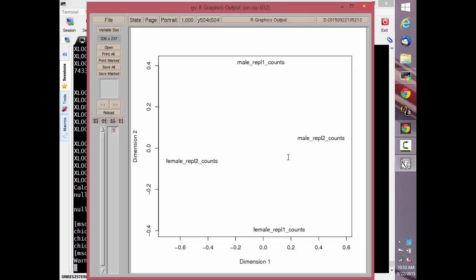The components it's creating are not actually individual genes. It's averaging several gene expression values, I believe the most differentially expressed genes and least differentially expressed genes, as your X and Y axes here. So it's trying to show you what should be showing up. Do you guys think that these are exhibiting batch effects or not? Is there such a thing as a batch effect in this case?